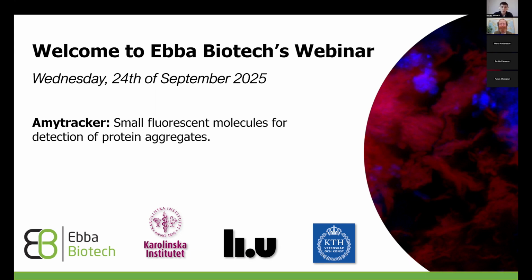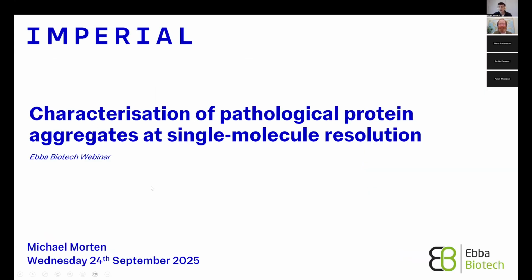Thank you very much, and hello to everyone. Today I just want to thank the organisers, obviously, for giving me the opportunity to present. It's really exciting to be able to talk to you about my work characterising protein aggregates, and it's nice on a level because we've worked with Ebba Biotech and used their Amytracker dyes to develop the fluorescence microscopy that we're going to be talking about today, and I'm going to describe how this has allowed us to study neurodegenerative diseases.